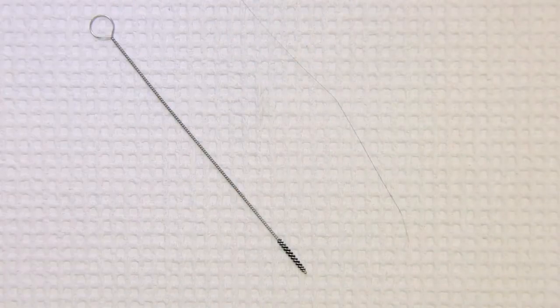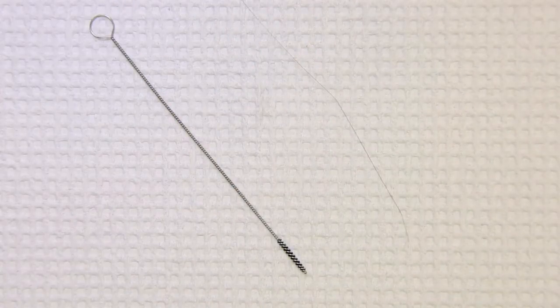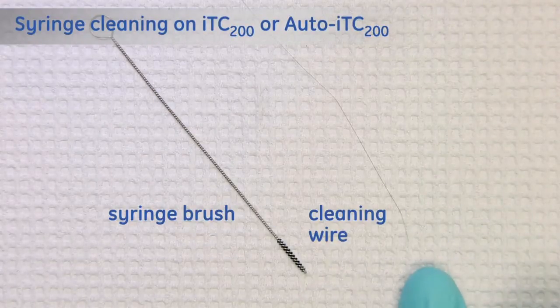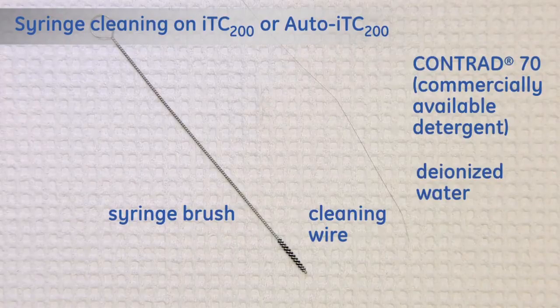To perform this procedure on MicroCal ITC 200 or Auto ITC 200, you will need a syringe brush, a cleaning wire, a mixture of Contrad 70, and deionized water.